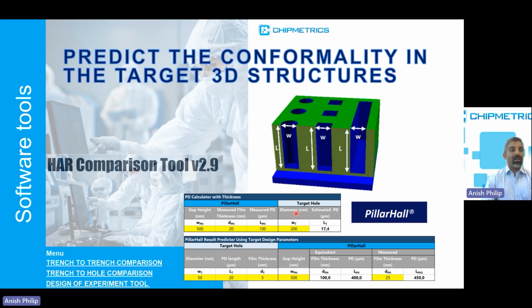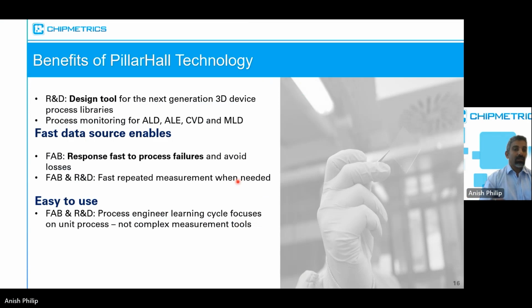In that way, as I mentioned here, we can compare the penetration depth between trenches, or trench to hole or hole to trench. We can also utilize this information, or utilize this calculator, for designing the experiments.